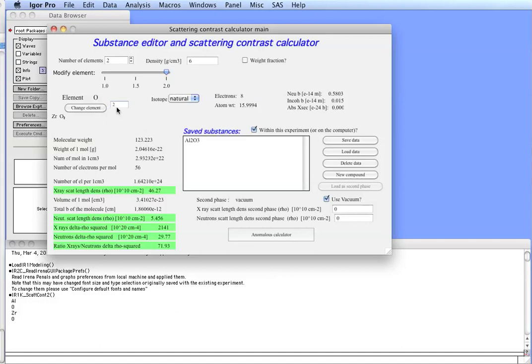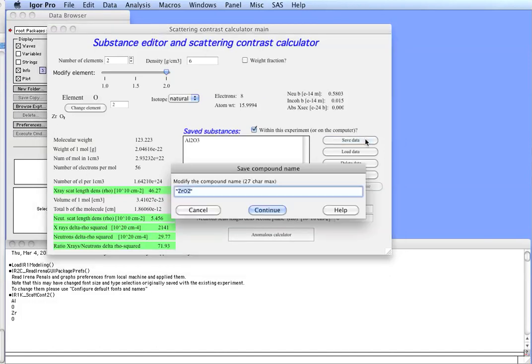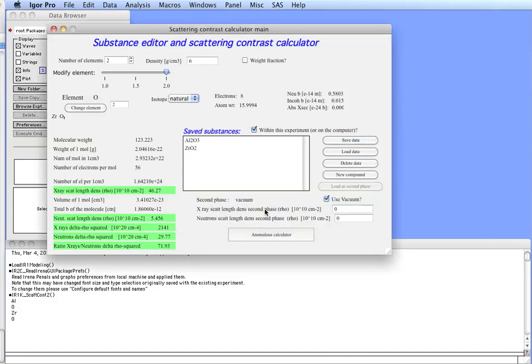So, it's number 2. So, now we have zirconium oxide. Density about 6. And these parameters are, as I said, neutron and 3-electron X-ray approximation. We can save that as a zirconium oxide. Okay.